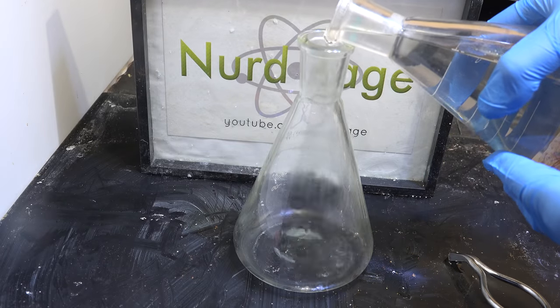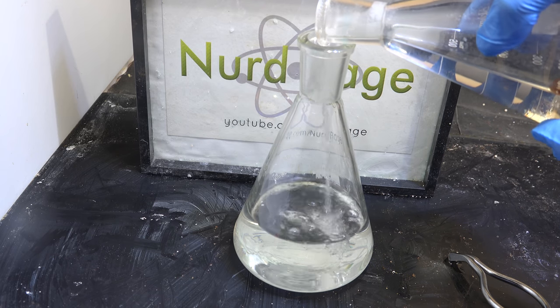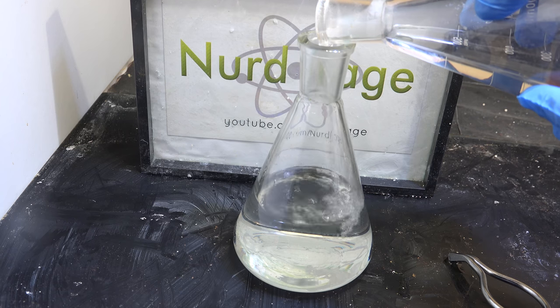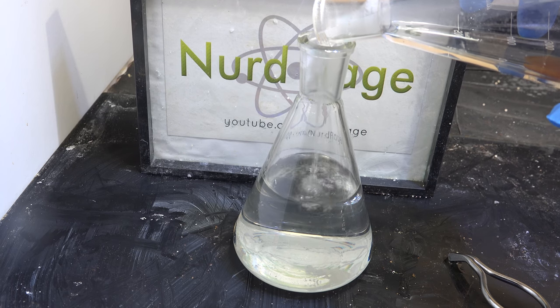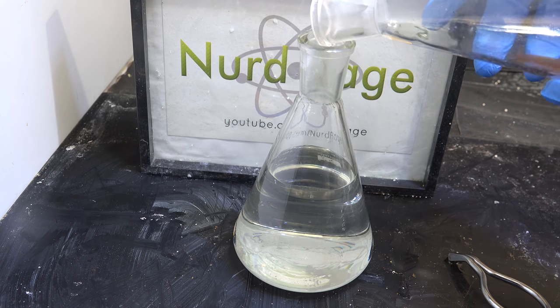We now simply decant our ether into a new container. Now for some very easy Grignard reactions this ether is pure enough and dry enough as is, but to improve reliability I'm going to go a step further and destroy the remaining impurities with sodium metal.